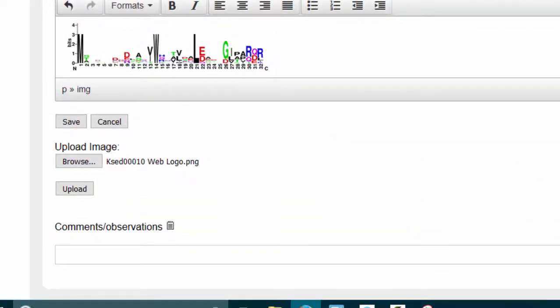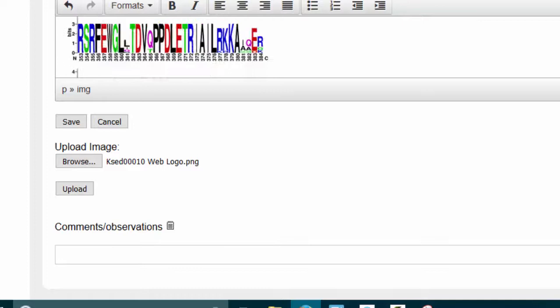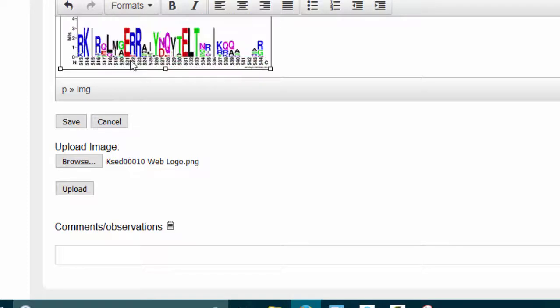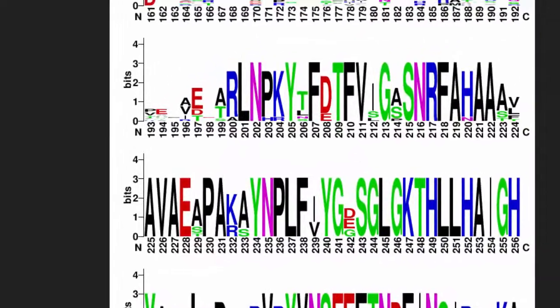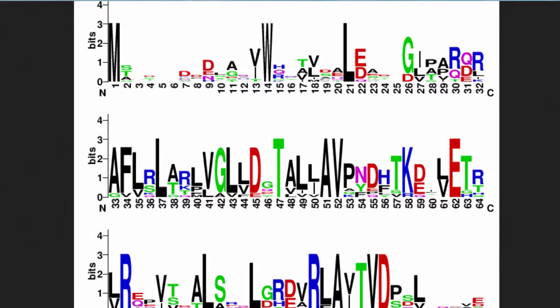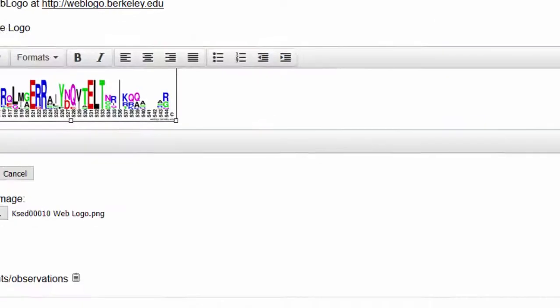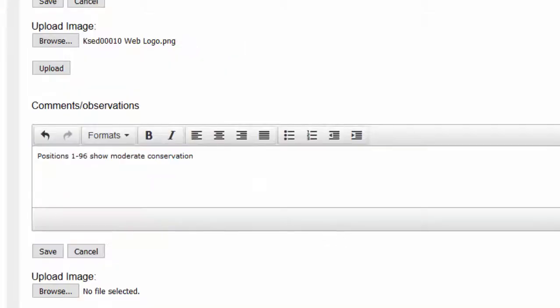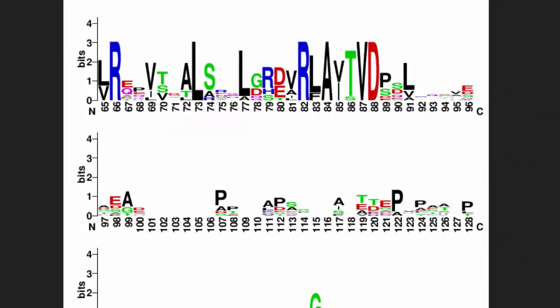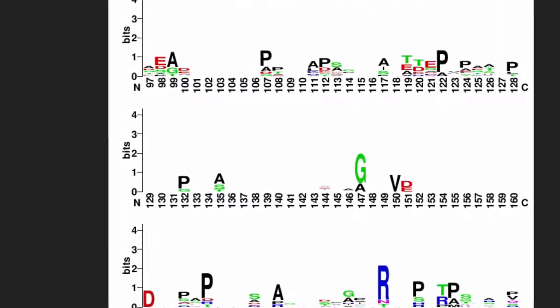Once you double-check it, make sure you save it. The comments/observations are where you're going to comment on it. So it might be easier to see on this one. So what I would say is, see how it says N right there? This is the N-terminal of the amino acid, whereas the very end is the carboxy terminus, or the other end of the protein. What I would say is positions 1 through 96 show moderate conservation.